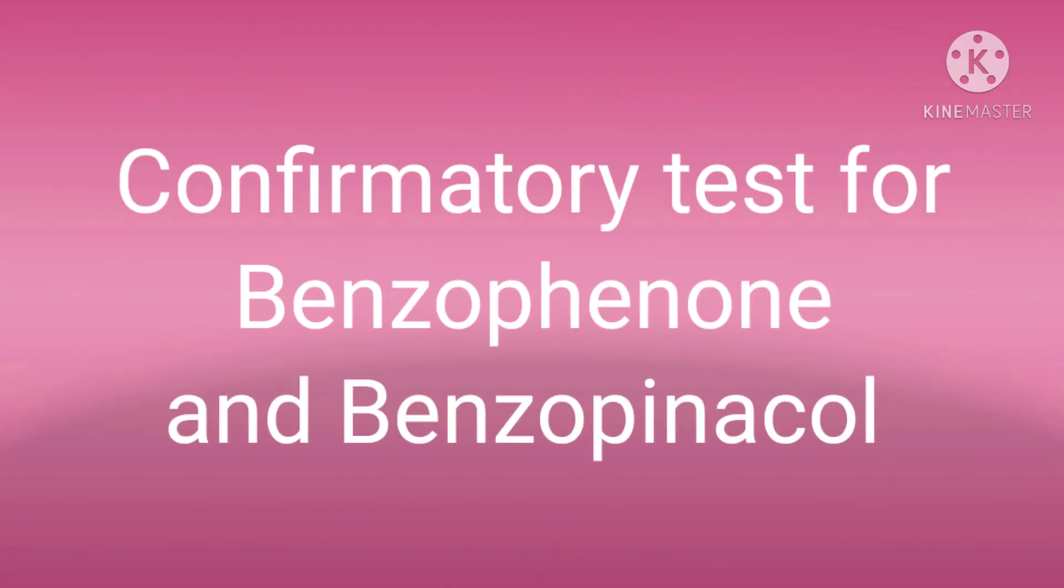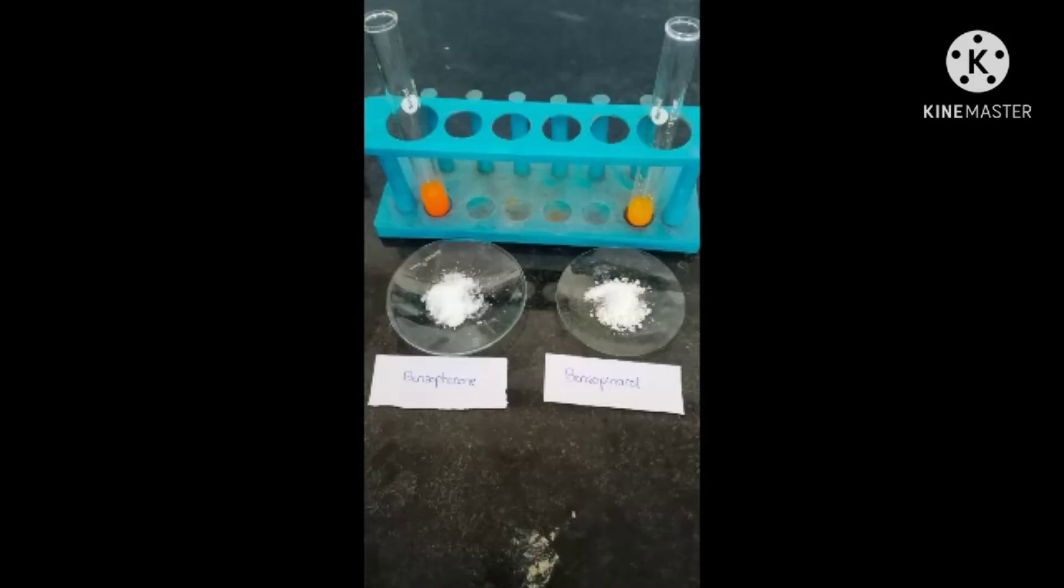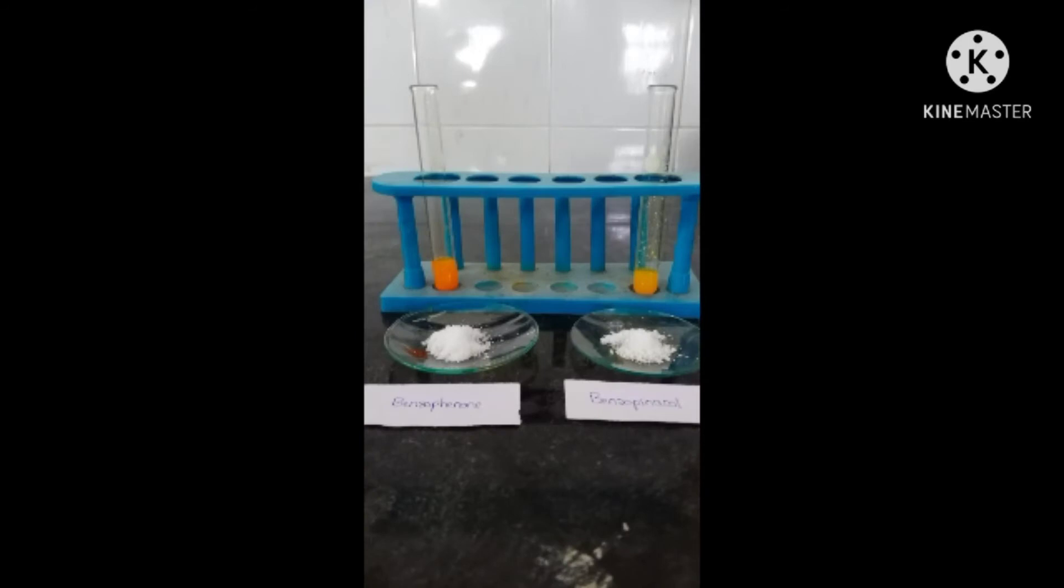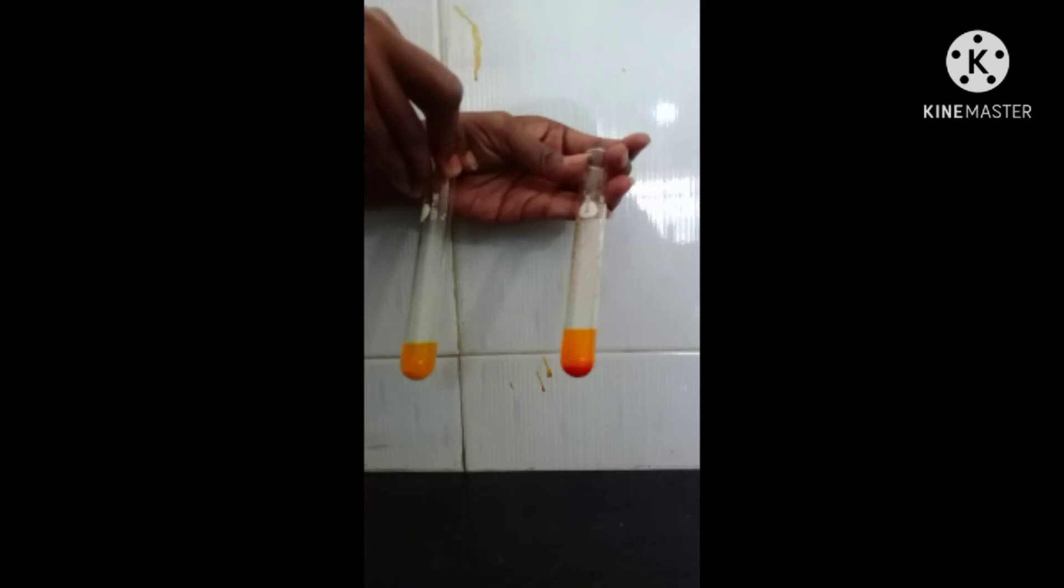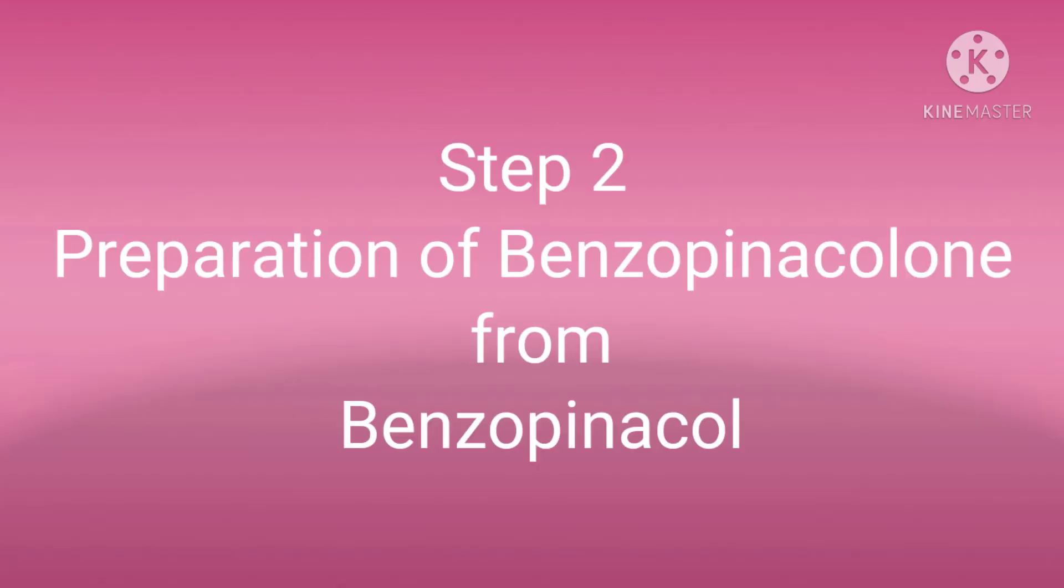Confirmatory test for benzopinacol and benzophenone. Here we are going to do 2,4 DNP test. Benzophenone gives positive test by showing orange-red precipitation.